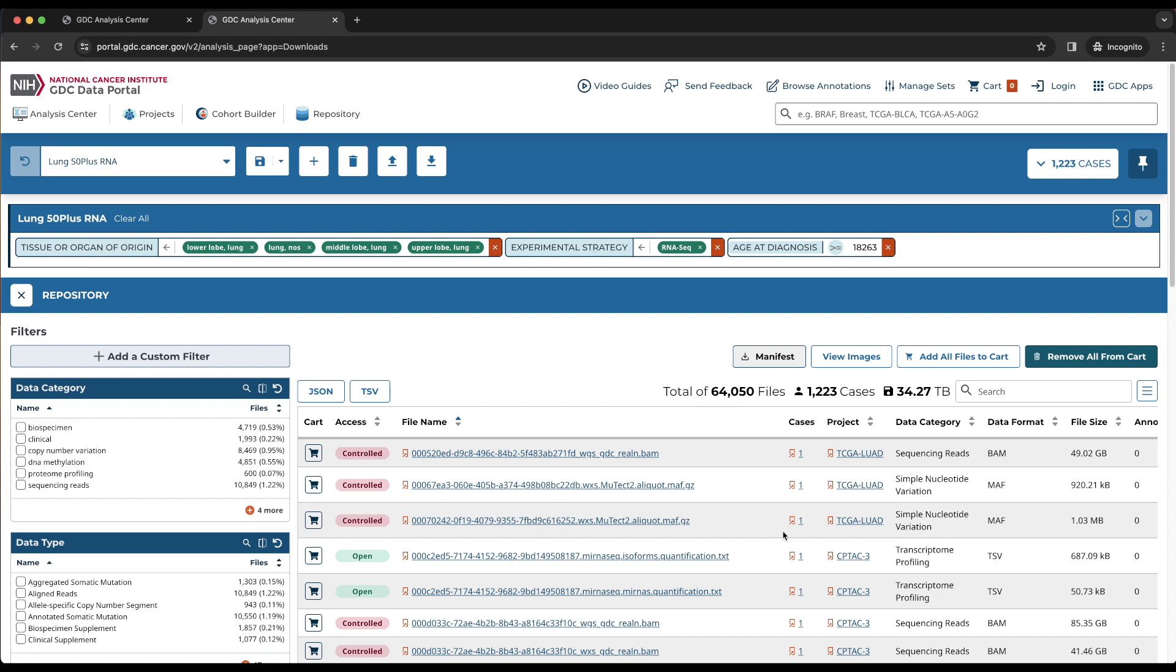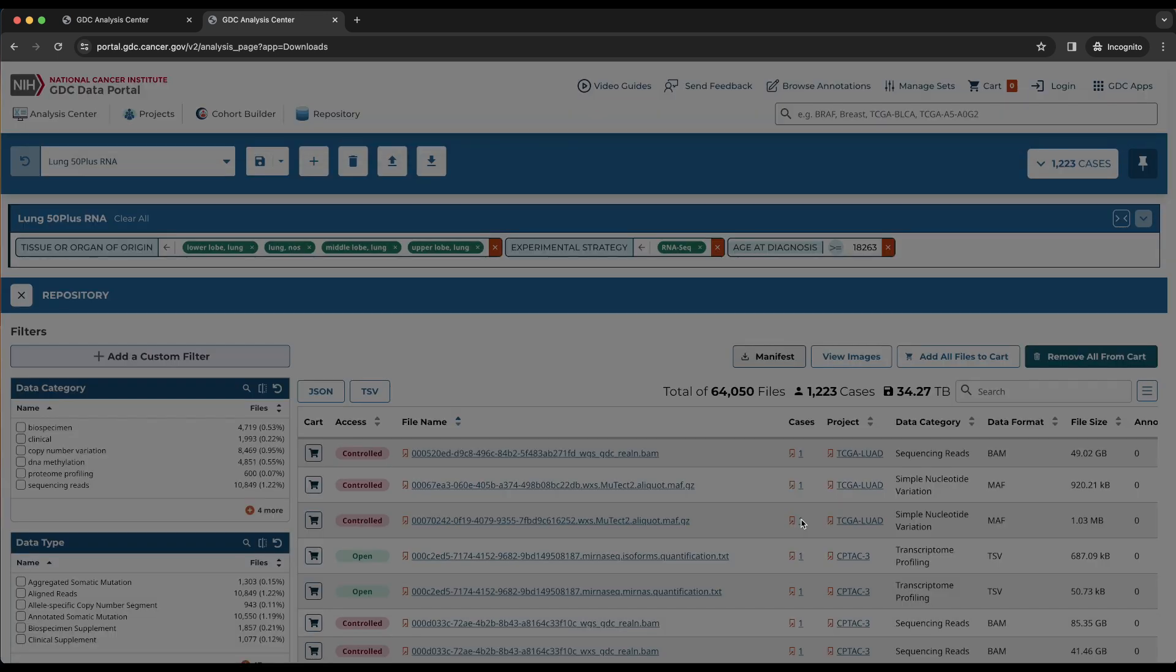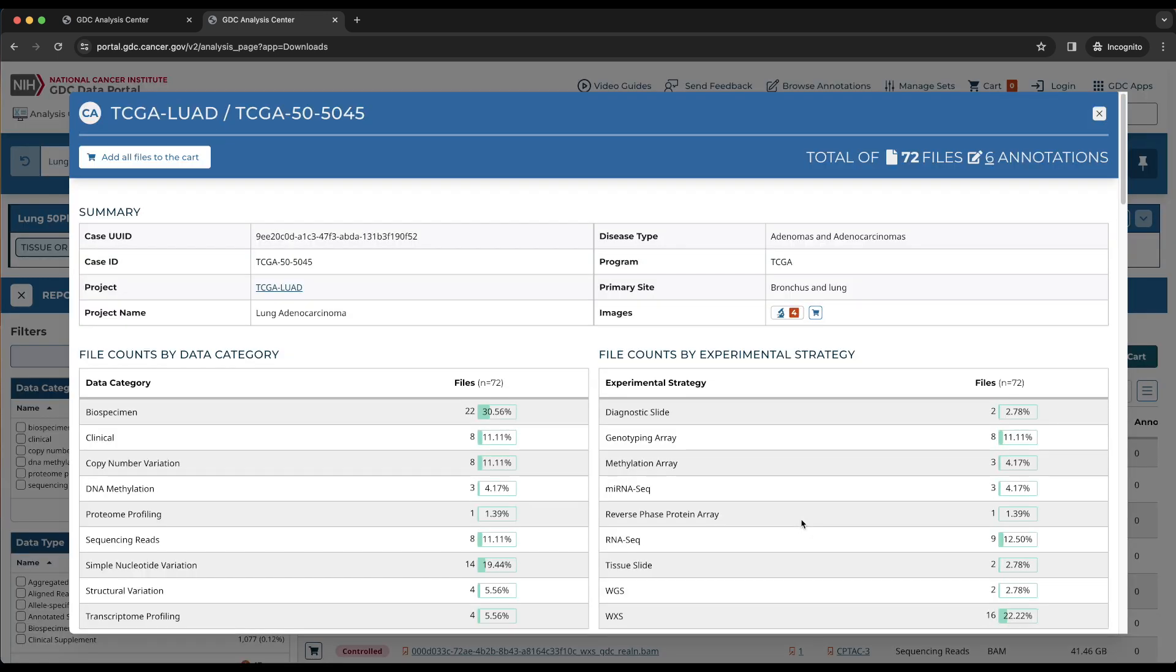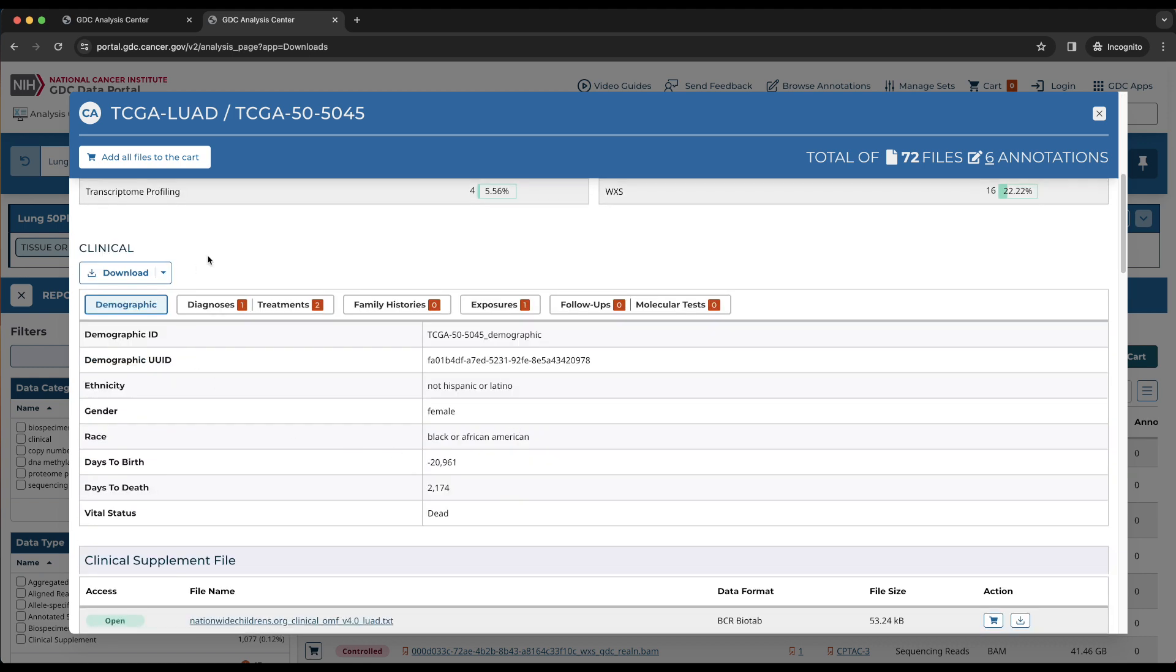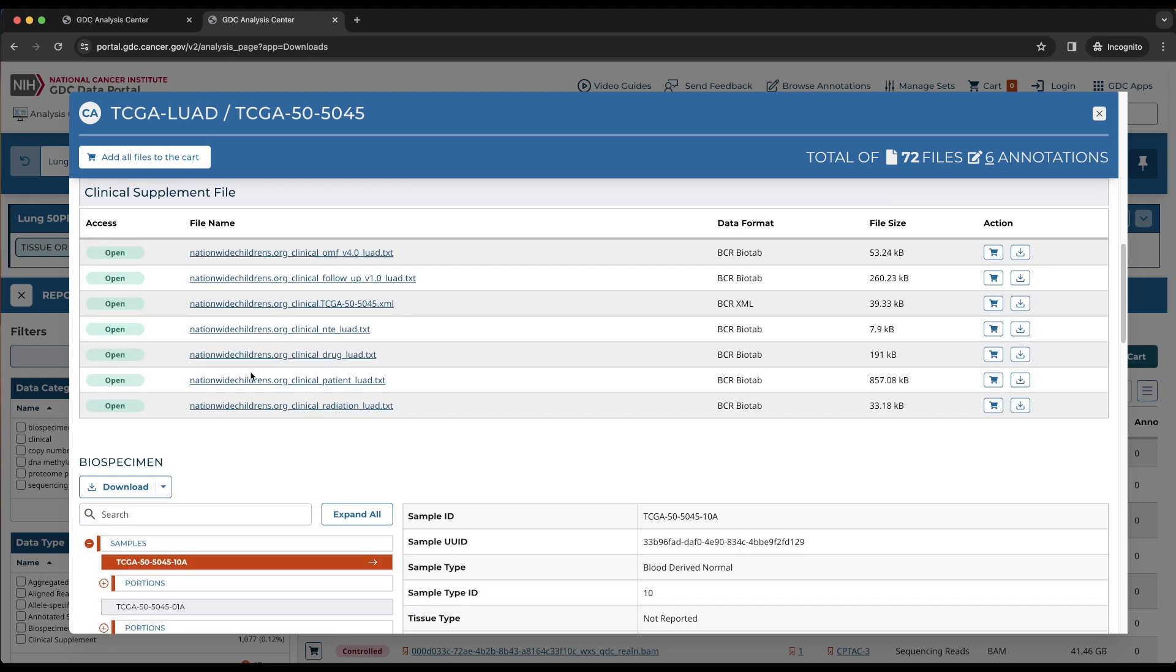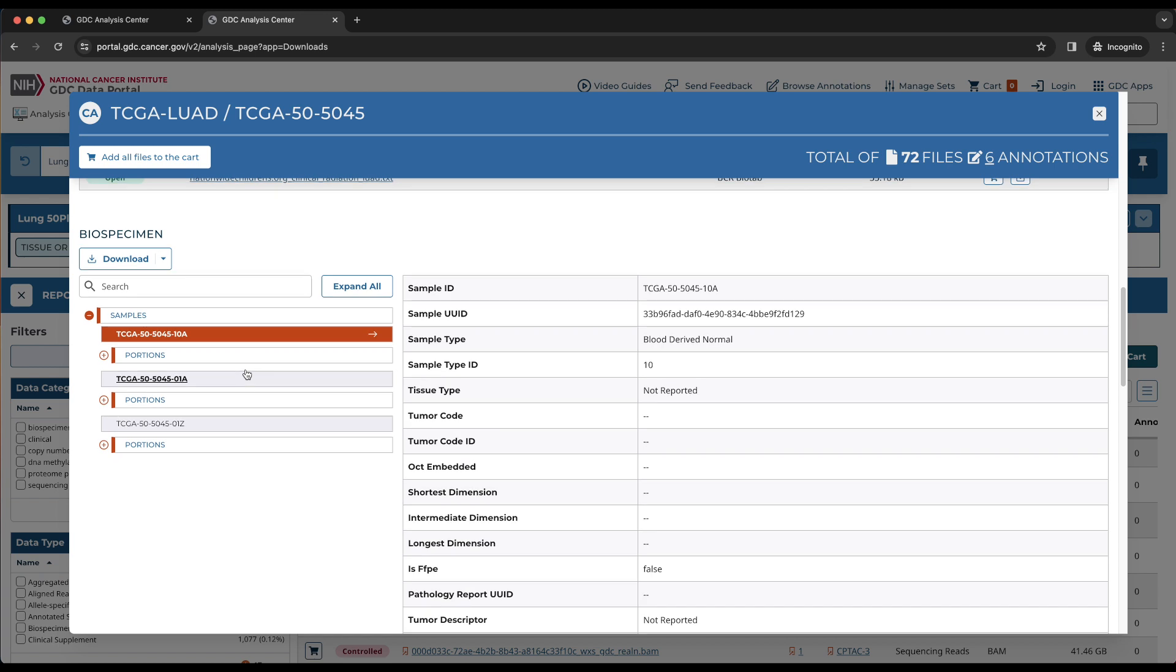Cases, which tells us how many cases are associated with the one file. Clicking on this number will bring up the case detail page popup, which displays information about the case, file counts by data category and experimental strategy, clinical data, and biospecimen data.